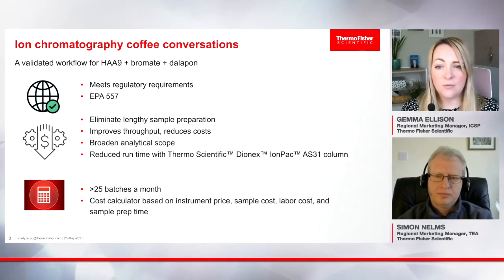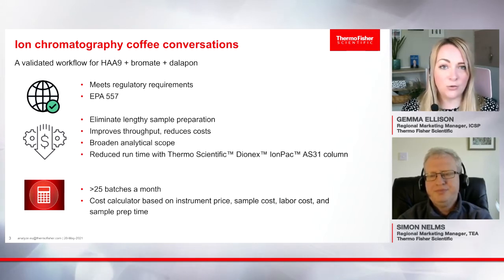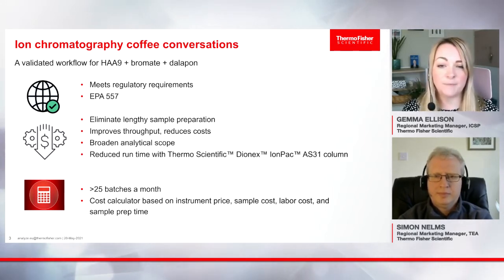No solvents are needed with the IC, so you're saving costs there, as well as the process of disposing of them safely. And then there's potential to use the IC or the ICMS for other applications done in a water lab, such as anions, oxyhalides, polar pesticides.